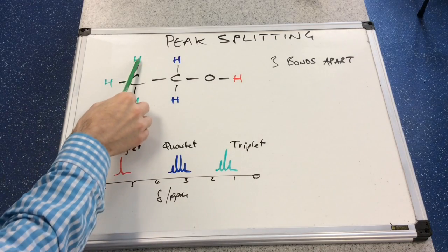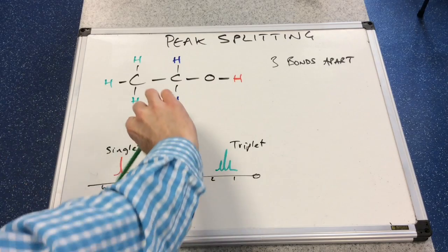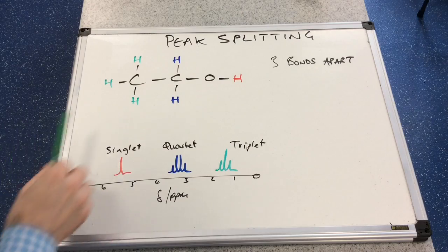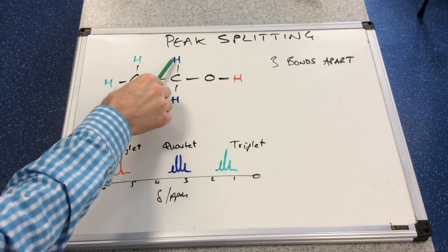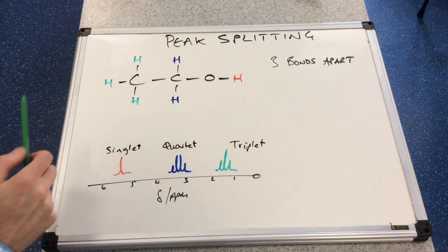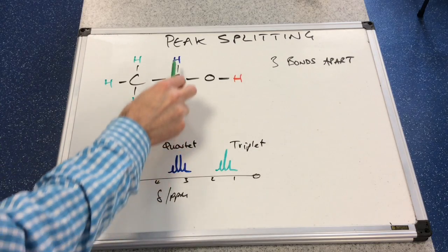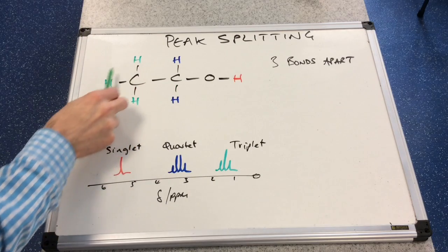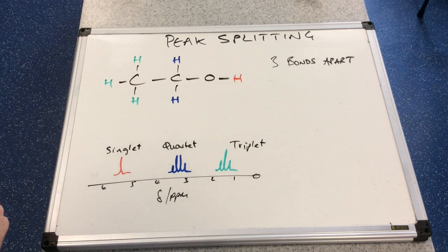Well, we think about how NMR works. This is why it's helpful to know about the spin states, sort of how much energy it takes to resonate the spin states. What happens is the adjacent protons that are no more than 3 bonds apart in a different environment, hope that's not too complicated to start with, their different magnetic field affects the magnetic fields that these protons experience.